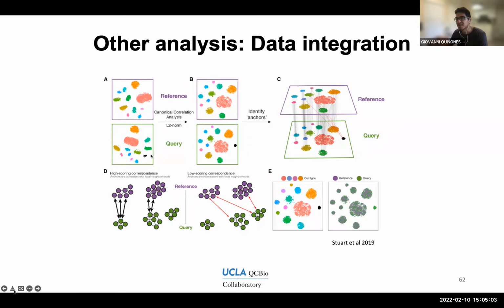But the main idea, and the idea I want to get to first, is that this is a technique used when you want to combine data from different samples. Now, these samples may be different replicates, or cells from a different person or a different patient that you want to merge together into the same data set.